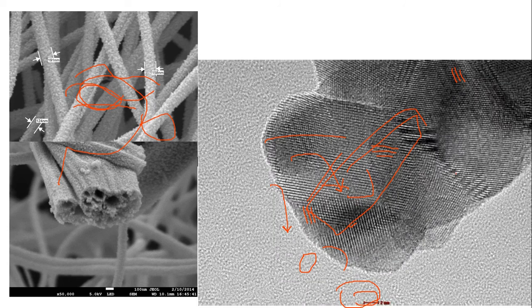And we see here that the lattice planes now are visible. We can easily find the distance between the two planes. In this plane, electrons are residing there. This is now one crystal plane. This shows that the material is polycrystalline, because all grains here have their own specific plane. This means that it is made from many single crystals.